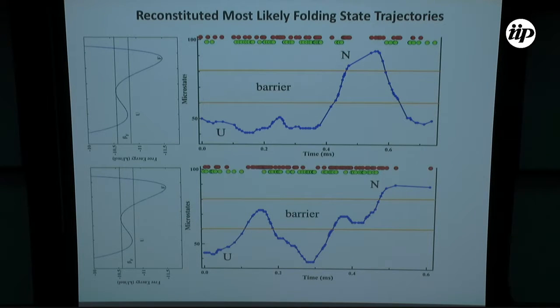So I don't think you can use this method to try to get distributions of transition paths, but you can definitely get some idea what the timescales are in a way that is not so dependent on the count rate and also not so dependent on the noise. But yeah, you have to be careful with these trajectories because they're not real.